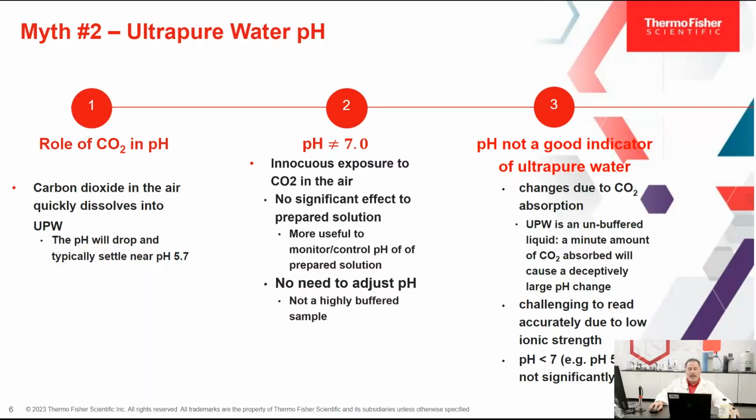So do I need to adjust the pH of the ultrapure water before I use it? Again, in most cases, we don't expect there's any need to adjust the pH. While the pH may be noticeably different than 7, the acidity of the ultrapure water is negligible. It's not a highly buffered sample.